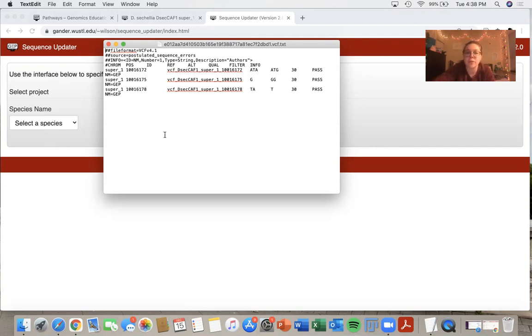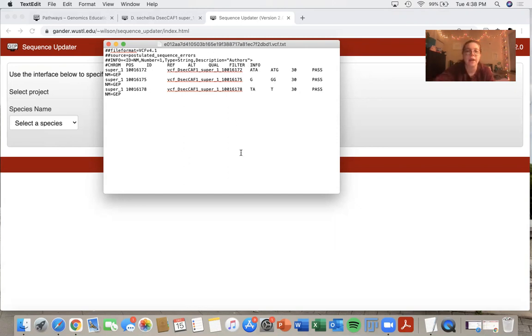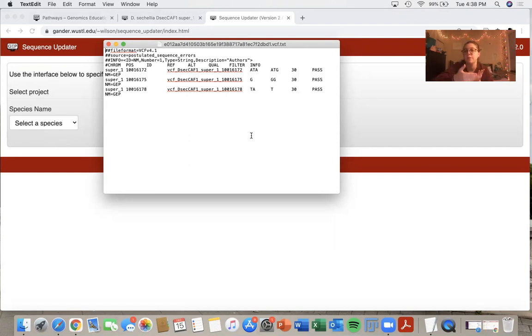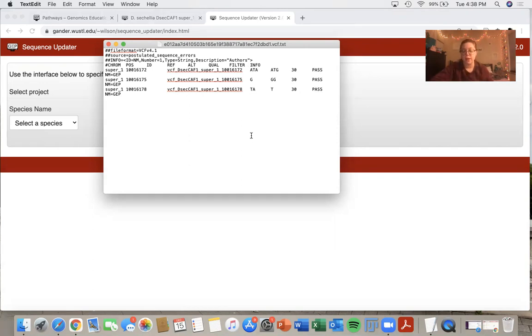So after you download this file, you would want to save it with a name that you would recognize. And then you would be able to upload this to the gene model checker in order to verify your gene model. So that is how you use the sequence updater. And I hope this was helpful.